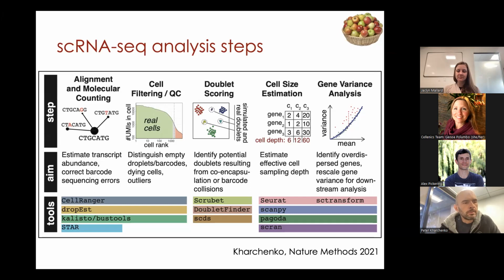So if you run doublet detection, which is a prudent thing to do, on a diverse set of populations here, it will probably give you pretty reasonable results. It will detect these very clearly mixed populations, and you can remove them. But if you run doublet detection on a closely related set of cells, let's say just the red cluster on its own, it might give you some false positives, or it will, at the very least, filter out some of the cells that are probably just fine, just red cells.